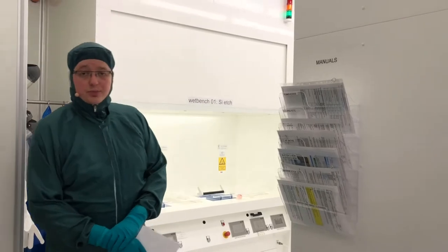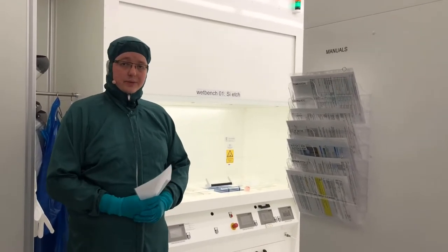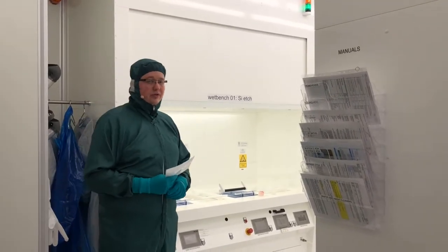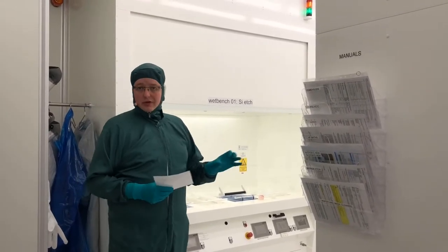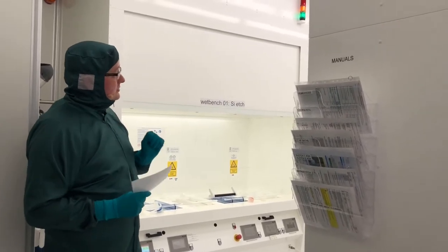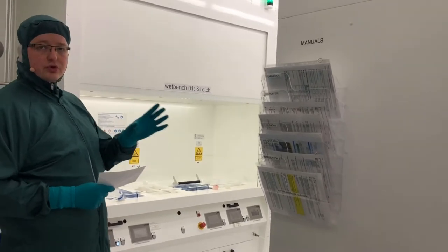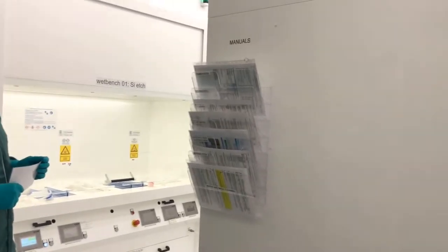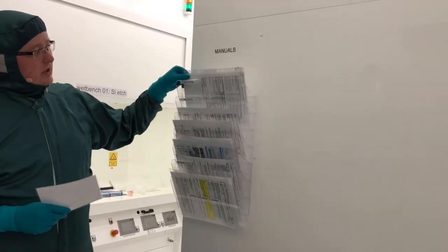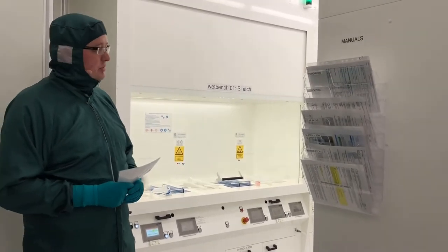Welcome to this presentation of fume hoods and wet benches at DTU Danchip. In the cleanroom at Danchip we have several different fume hoods and wet benches, many of them here in cleanroom D3. When you want to use fume hoods and wet benches, first of all you should read the manual and the APV for the equipment. You will find the manual in the areas where we have the fume hoods, wet benches and other chemical equipment.